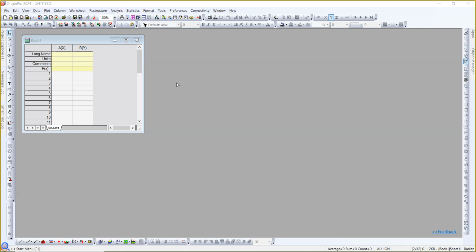We want to talk about how we can plot XRD patterns in multi-stacking order. As we can remember, in the previous video we talked about how we can plot XRD patterns for one data set, but in this video we want to do it for many XRD patterns, or for many columns of data.